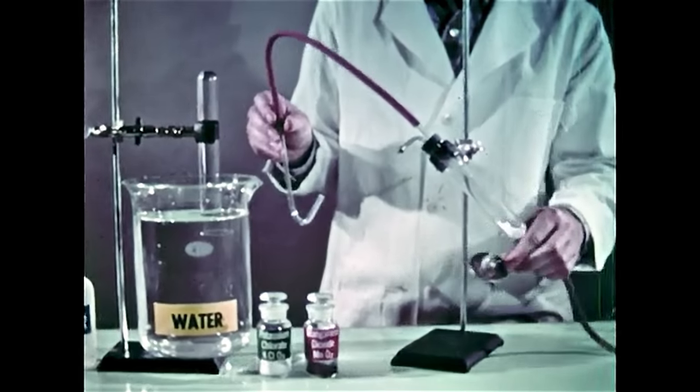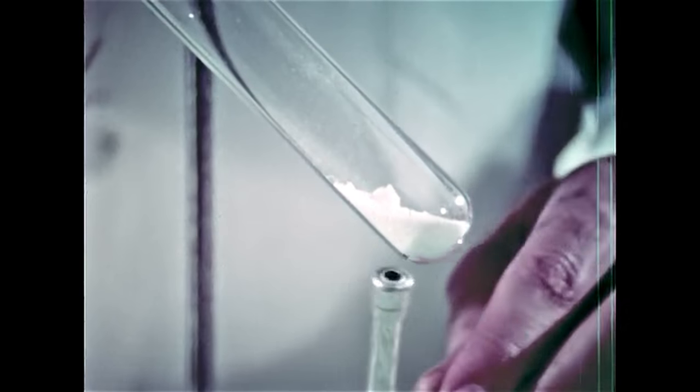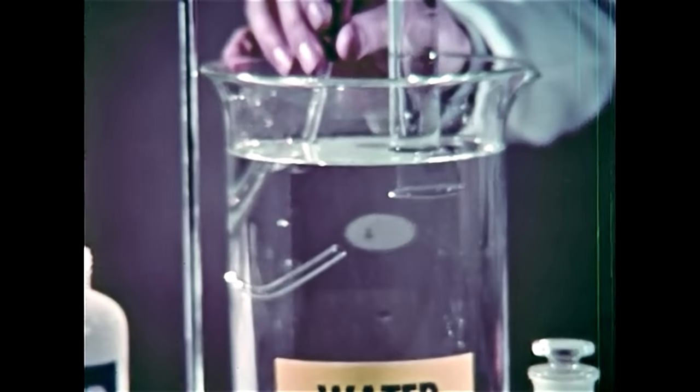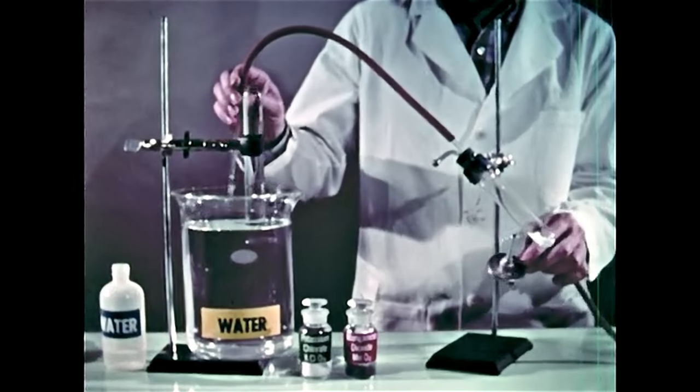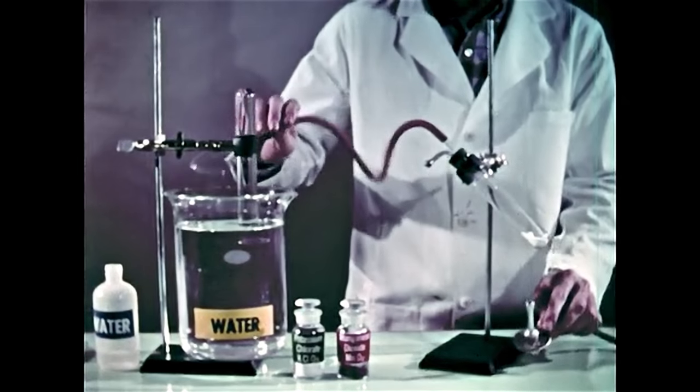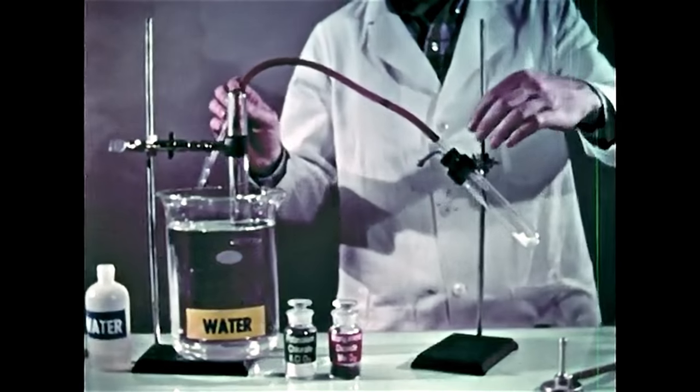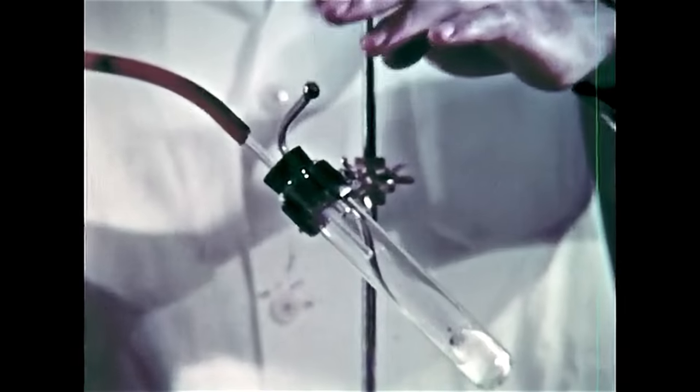Now the potassium chlorate is heated gently to get the air out of the delivery tube and to show that you won't get much reaction before adding the catalyst. Of course, if you heated the potassium chlorate well above its melting point, it would break down into the products potassium chloride and oxygen. But the catalyst saves both time and trouble.